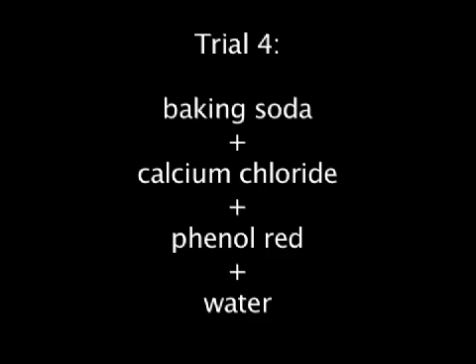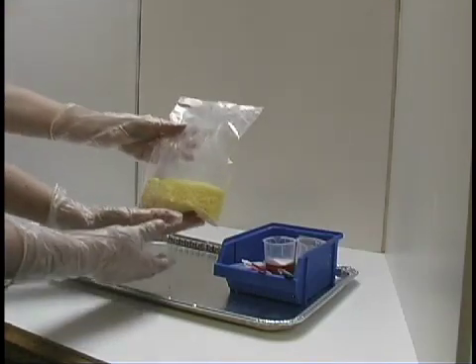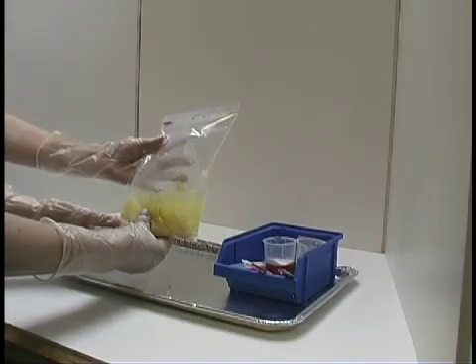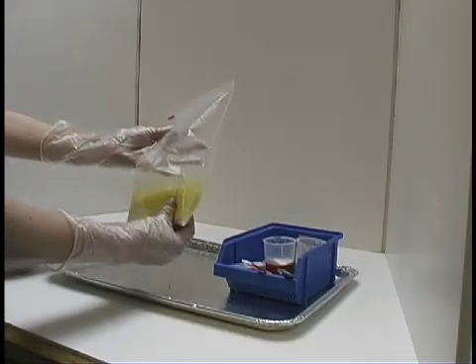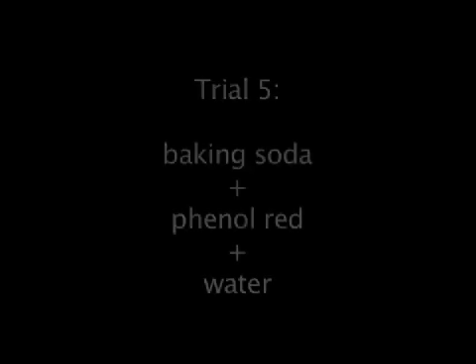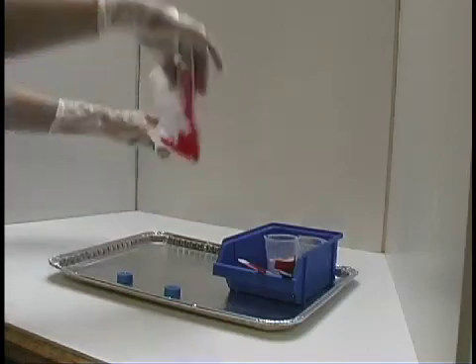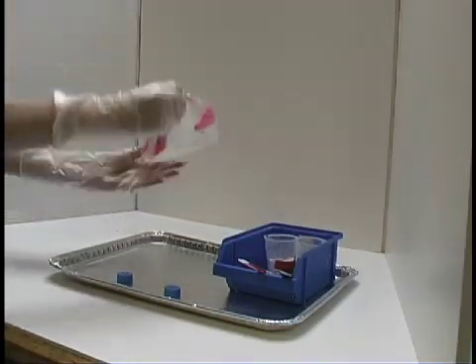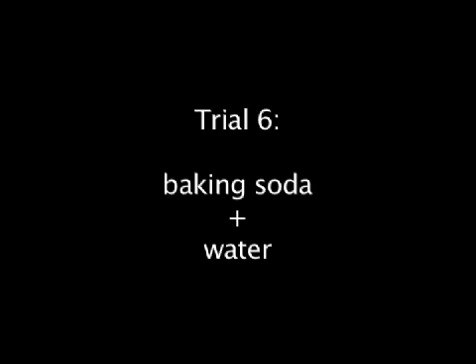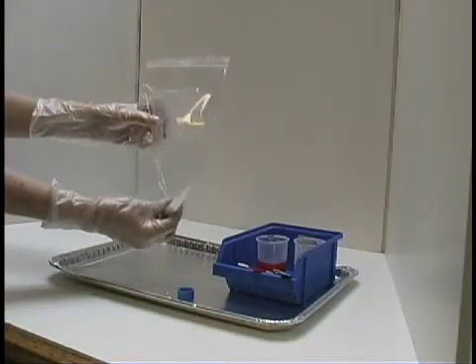Baking soda, calcium chloride, phenol red, and water turns yellow and gas and heat are produced. Baking soda, phenol red, and water turns magenta. Baking soda and water feels cool to the touch.